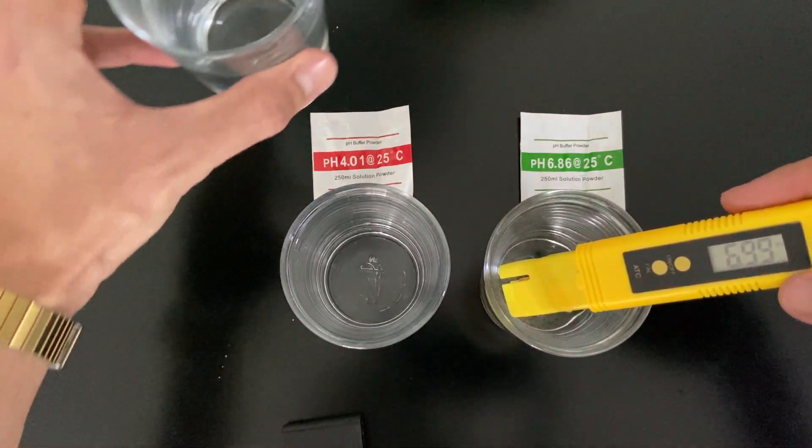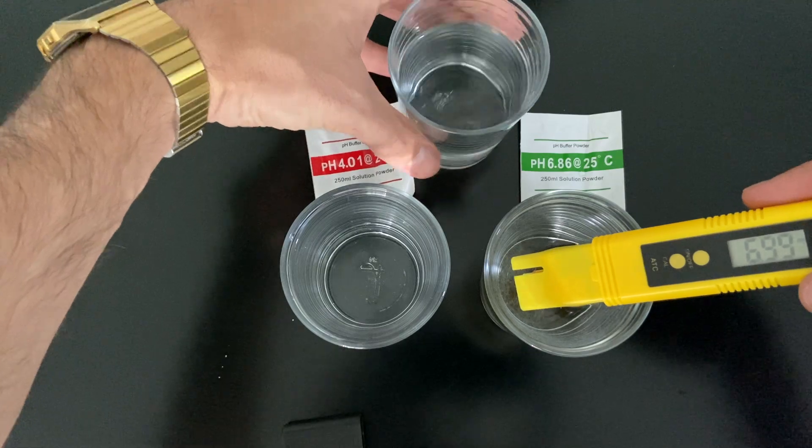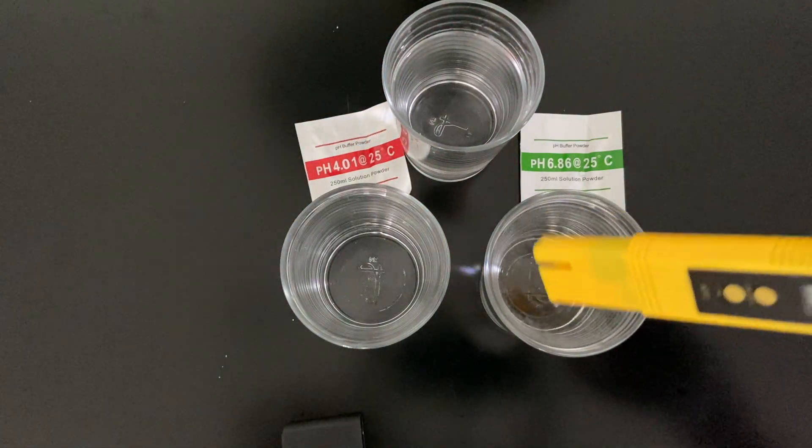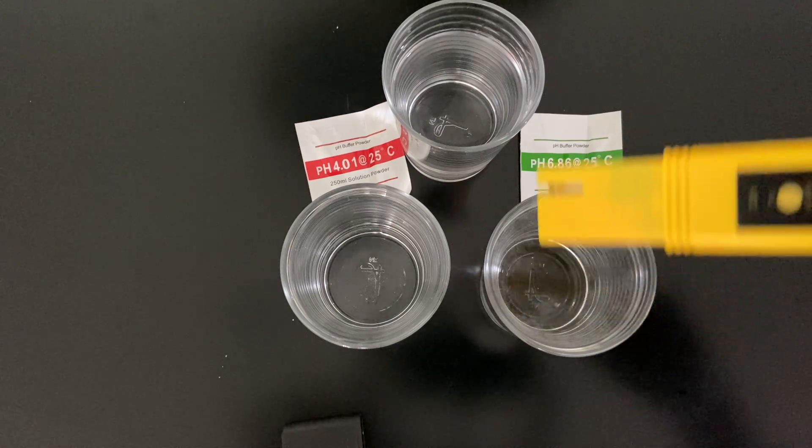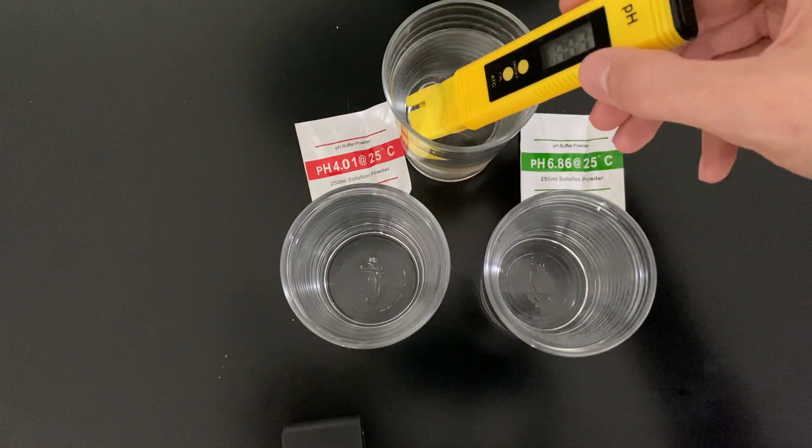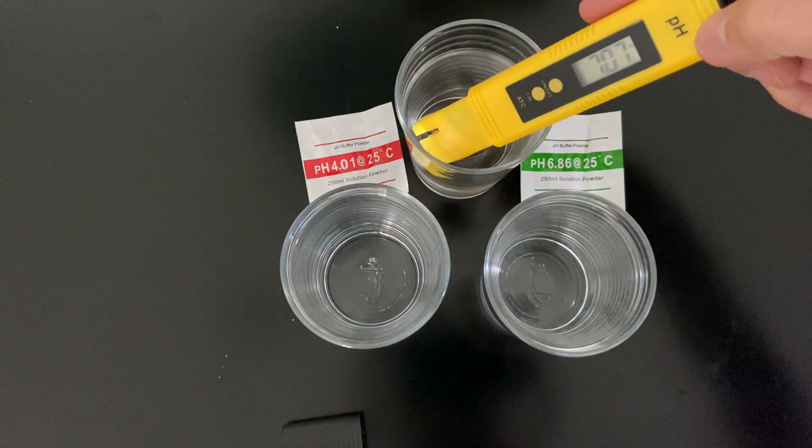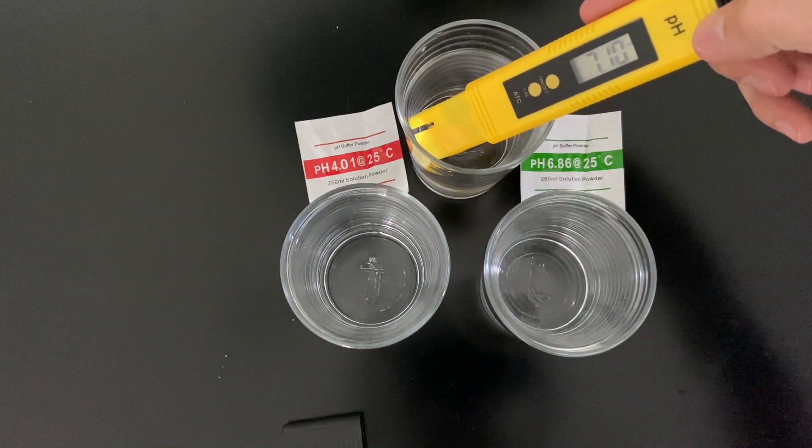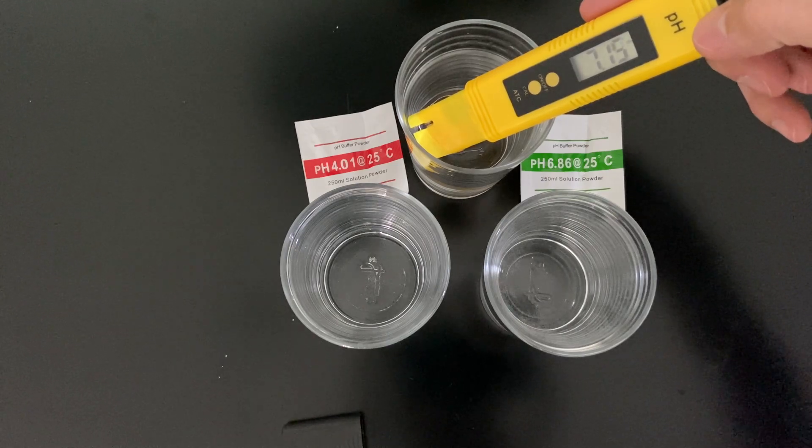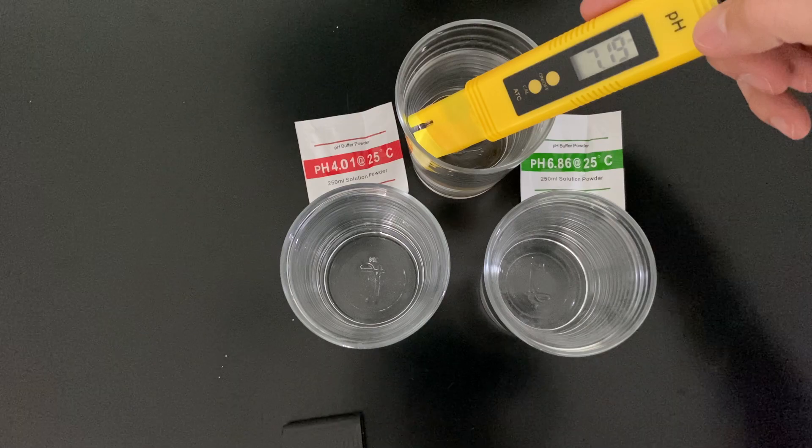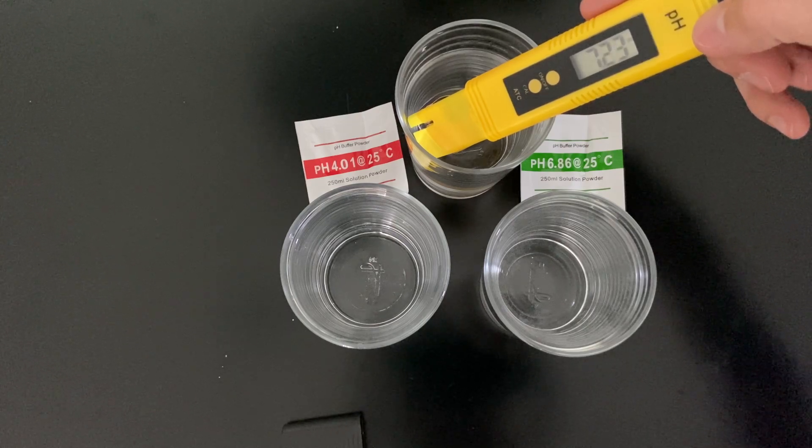Now I took a sample from my tap water here at home. Let's see what is the pH from my water supply. It's showing 7.07. Let's wait for it to stabilize the measurement.